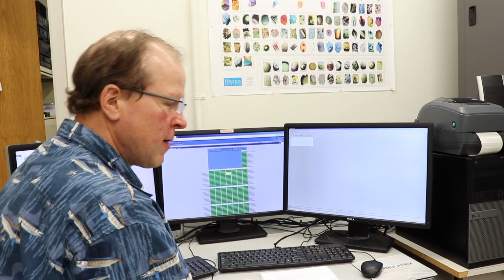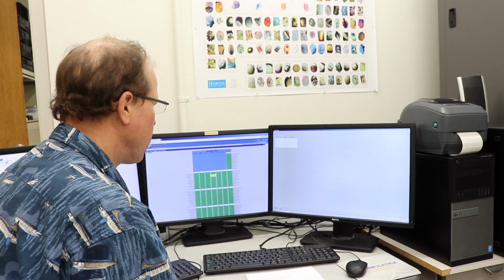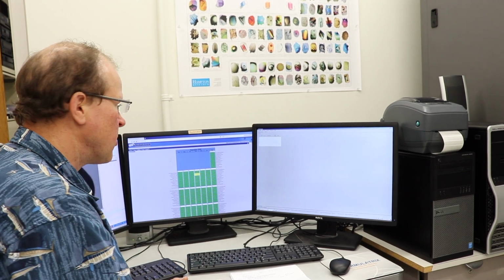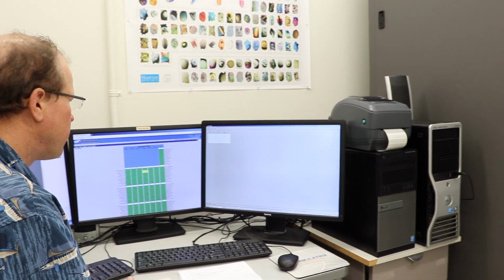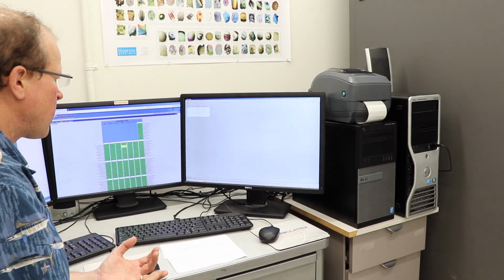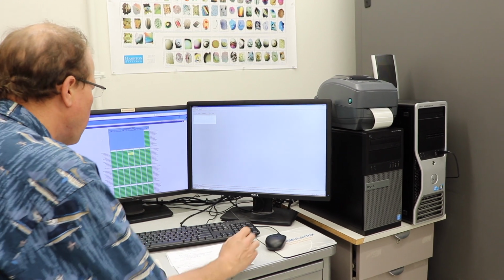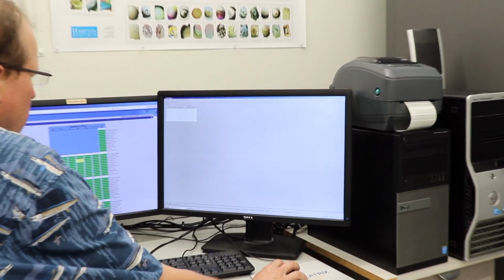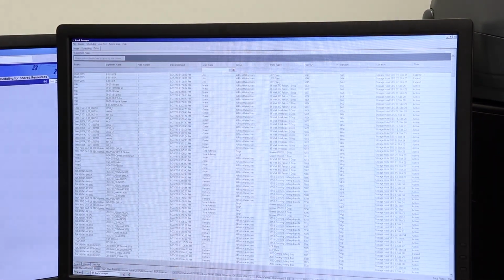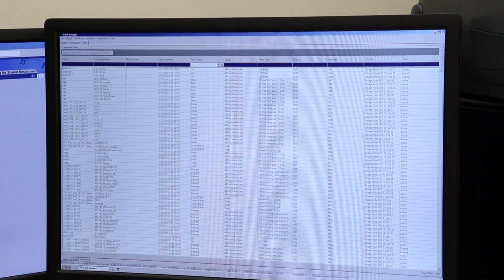Okay, so to retrieve your plates from the imager, when either you have crystals you want to harvest, or if your plates experiments are too old, you want to remove them, especially if they're too old, because they'll be taking up space, and also over time the seal dries up and that can jam the robot. So under the Plates tab here, you'll go to the Search sub-tab and find your plate. Again, you can search by your name or the plate number.